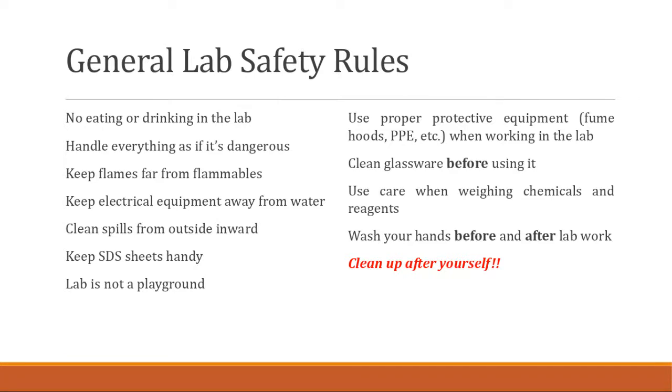And the next one would be to clean up after yourself. I say this, and this is probably my strongest one, when you're in the lab, you have to clean up after yourselves. It's just good for the lab. It helps everybody move along with their lab, so that the next group that comes in isn't spending their lab time cleaning up a mess that was created by you. It's just a good way to make a lot of people mad. So my big rule is to clean up after yourself.